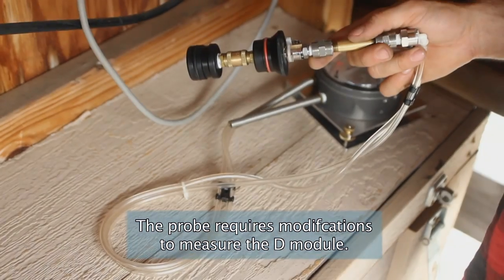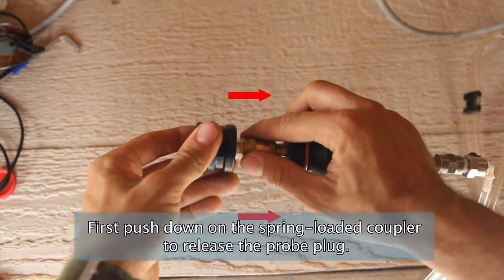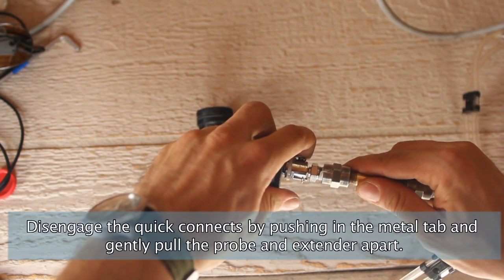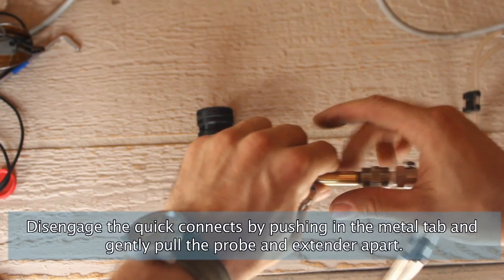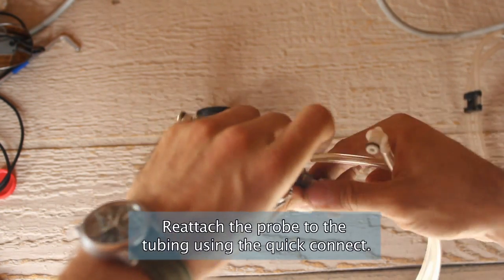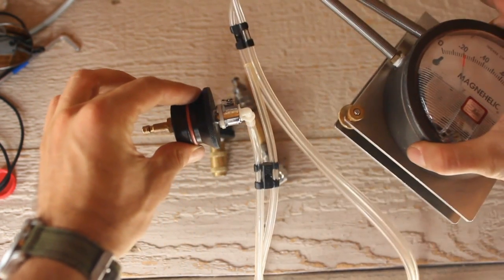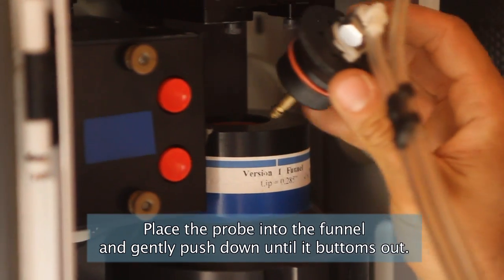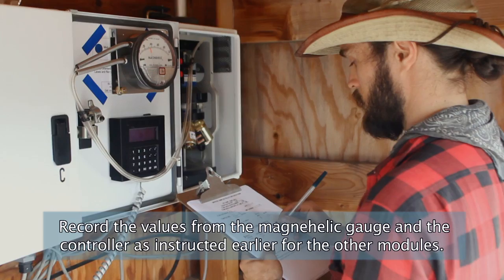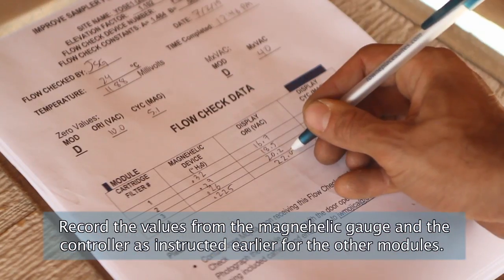The probe requires modifications to measure the D module. First, push down on the spring-loaded coupler to release the probe plug. Disengage the quick connects by pushing in the metal tab and gently pull the probe and extender apart. Reattach the probe to the tubing using the quick connect. Place the probe into the funnel and gently push down until it bottoms out. Record the values from the Magnehelic gauge and the controller as instructed earlier for the other modules.